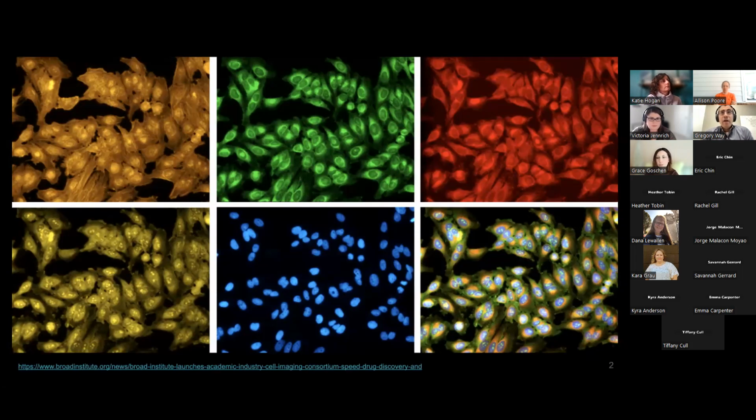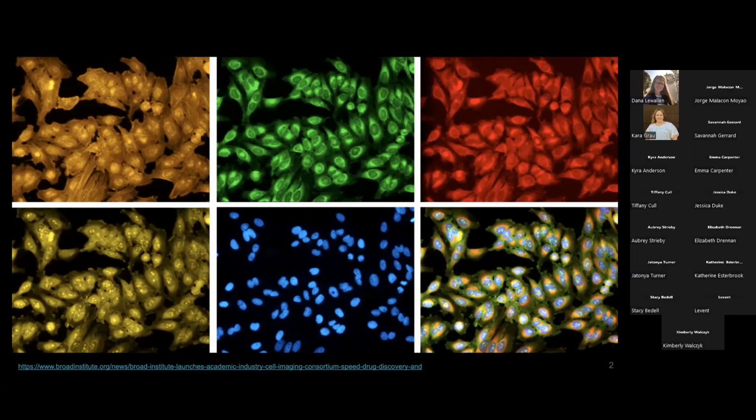Oh, she's good. So the cell painting assay is going to stain for a bunch of different organelles. It looks like we have some feedback. Fairly well right now, so. Yeah, okay, sounds good.